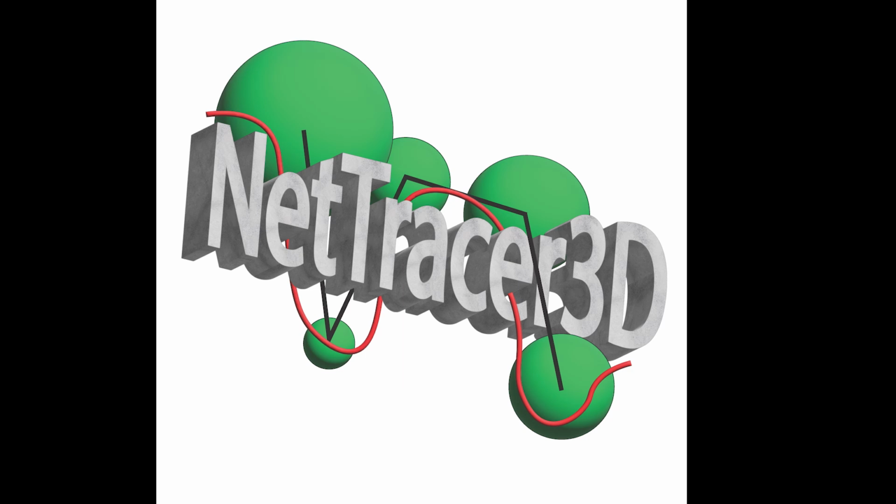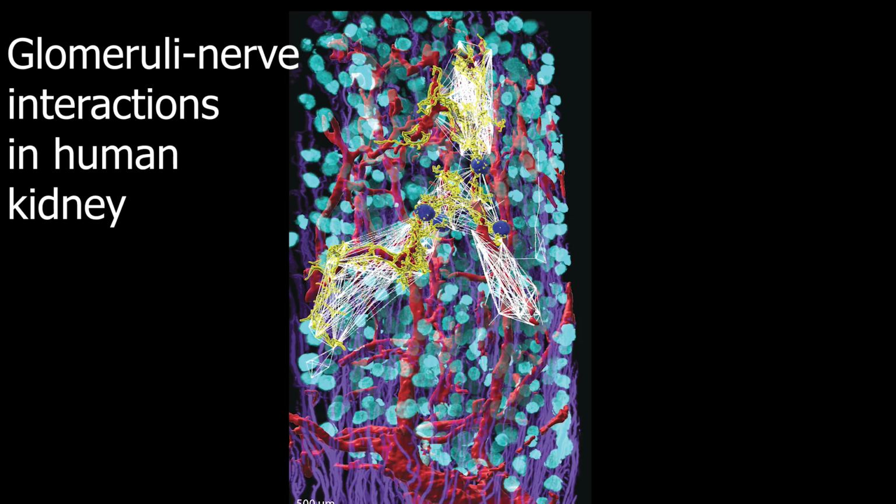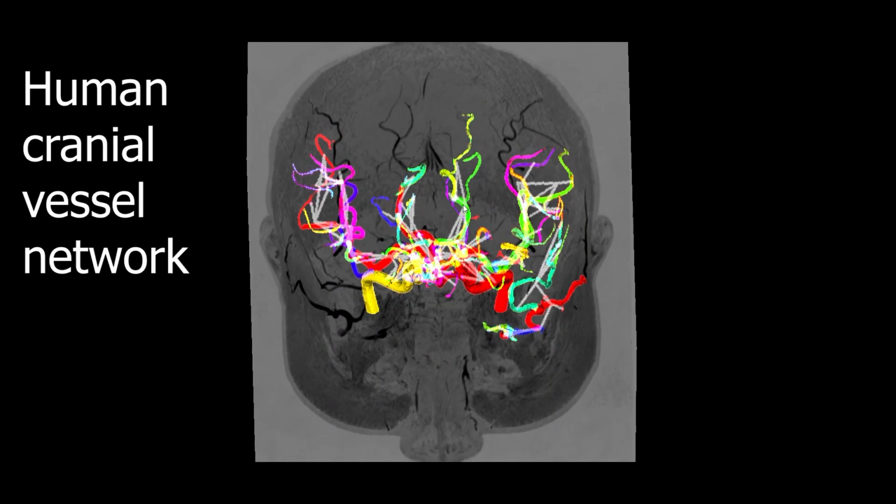Okay, so this is going to be the first of a few series of videos that I'm making about how to use my program NetTracer3D. This is a program for analyzing three-dimensional images, mainly the kinds that you would get from microscopy or from medical imaging, mainly for scientific analysis.